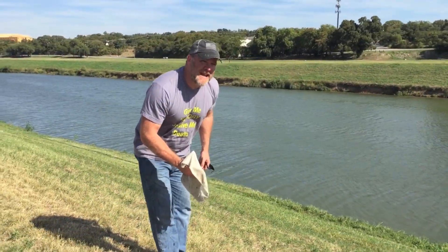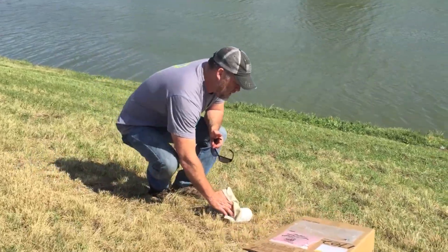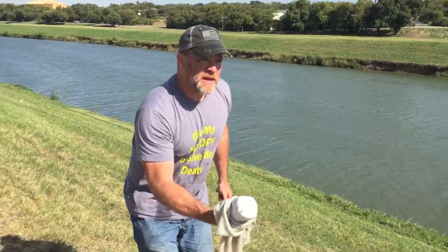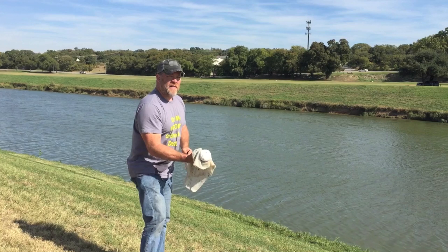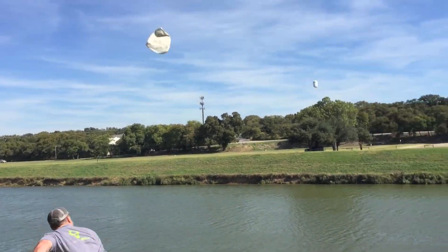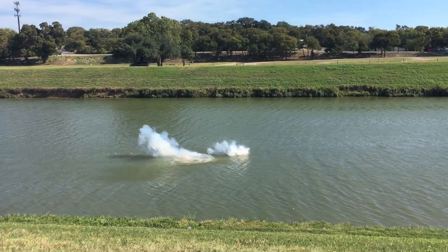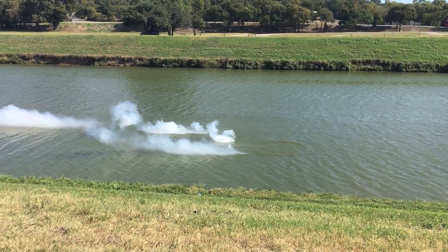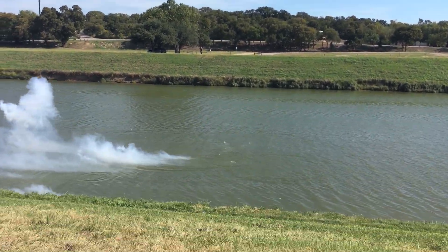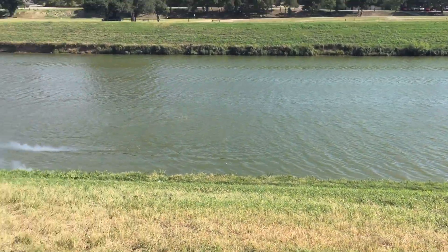Okay, so that explosion wasn't as big as I expected and I didn't know why. But what happened is during the explosion — this is hot — we're gonna try this one more time. My friends, that is what happens when you put sodium metal in water. It produces a hydrogen gas, it heats up — trust me, it was really hot. That reaction goes faster and faster and faster. That's what you saw.